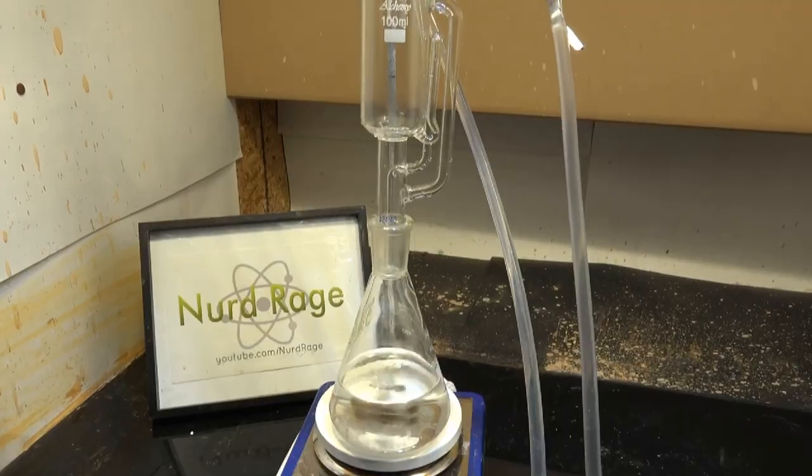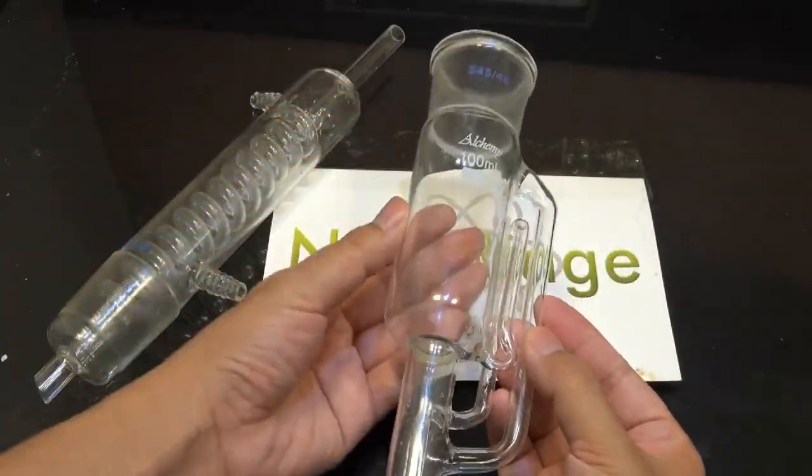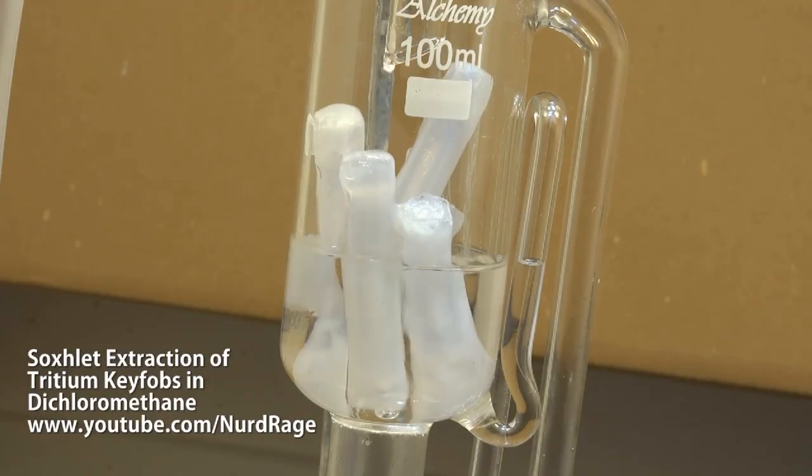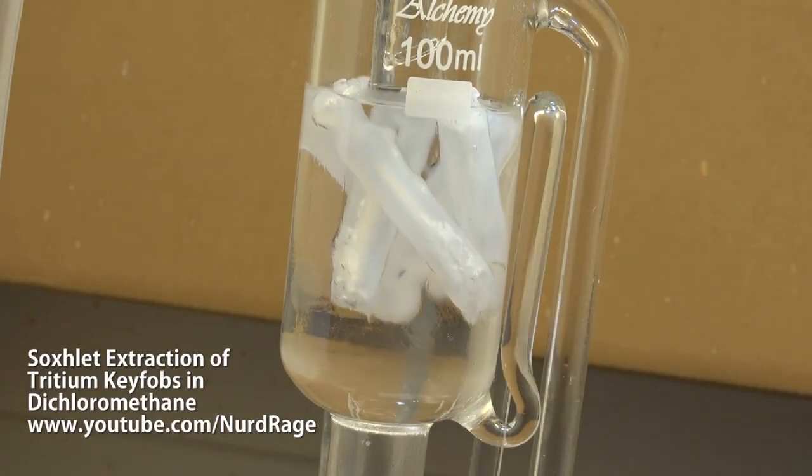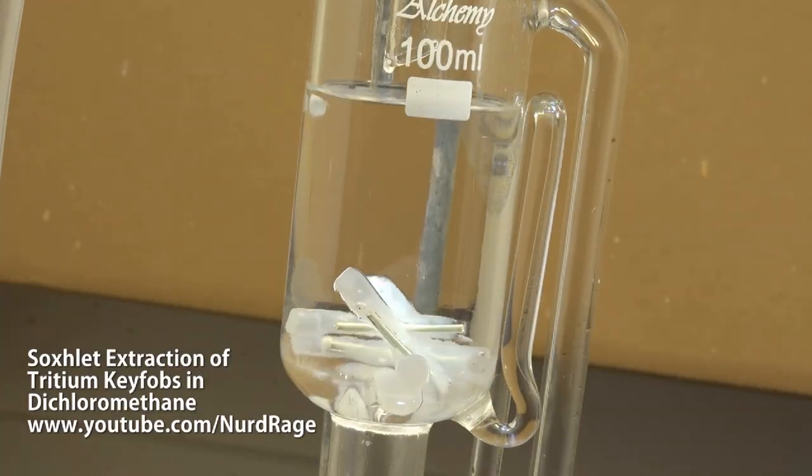Normally a chemist would use a setup like this. This is footage stolen from NerdRage, if you don't know him, go check him out. Anyway, the key feature here is the Soxhlet Extractor. It is a device that you can load up with stuff and it will automatically cycle fresh solvent through it.